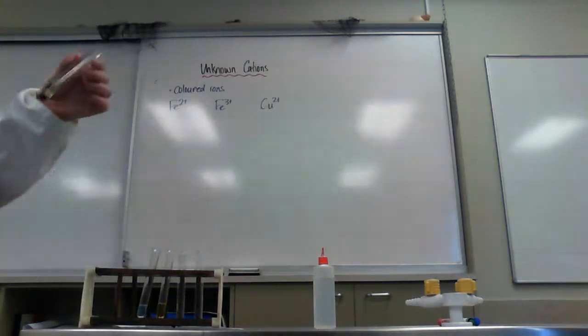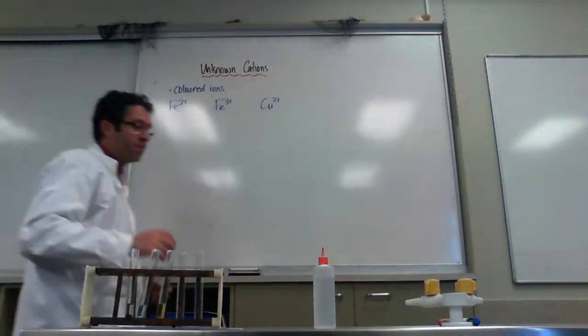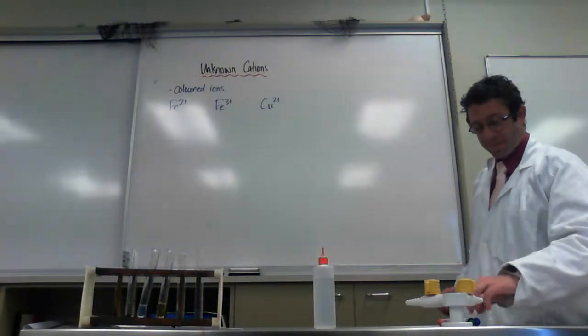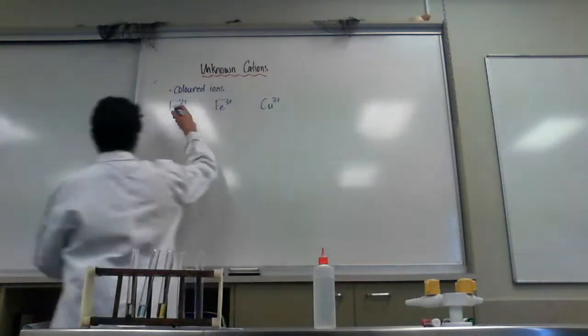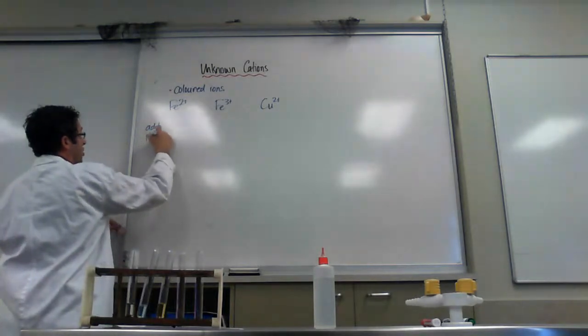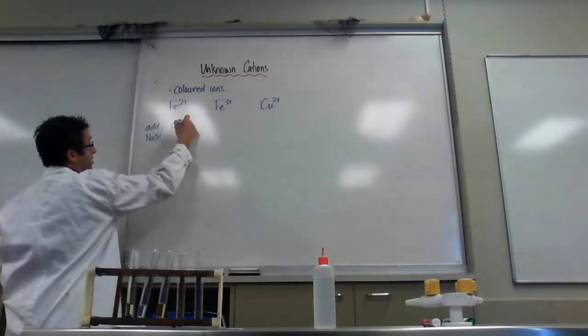And that green precipitate, sort of a forest green color, is what we're looking for to confirm that it is indeed due to the Iron 2+. So if I add NaOH, this gives a green precipitate.